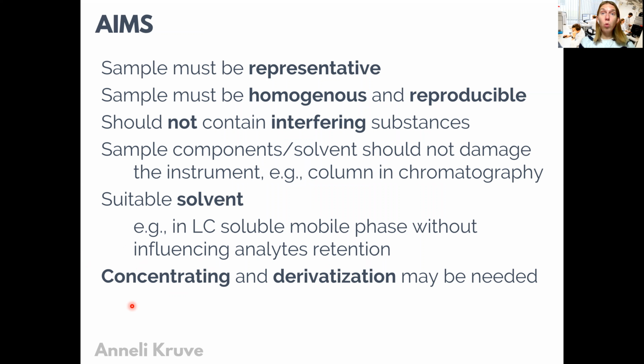In some cases, dilution can also be very important. This is when we are dealing with very concentrated samples. We would like to get our analyte concentration into the linear range. So this is especially important, for example, if we deal with the analysis of the main components, or with the analysis of assays in case of pharmaceutical quality control, for example.